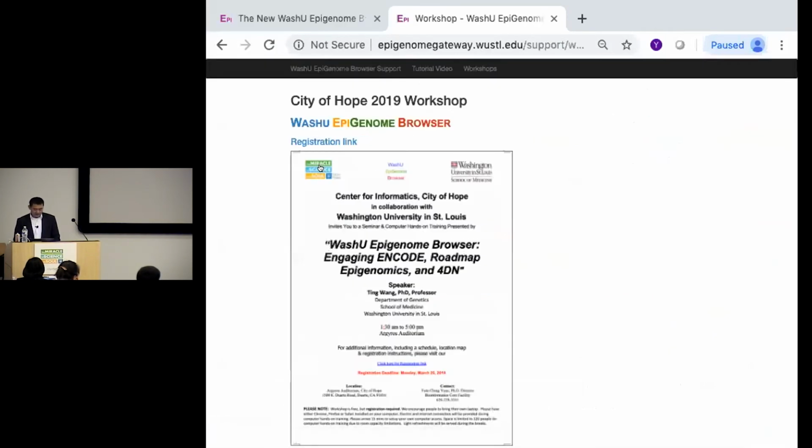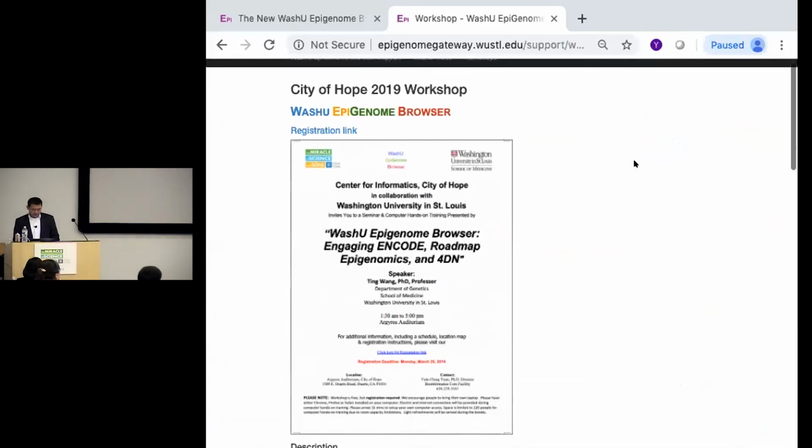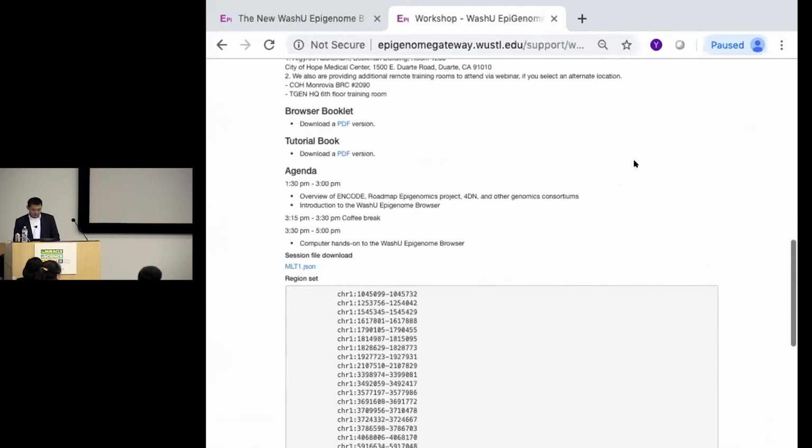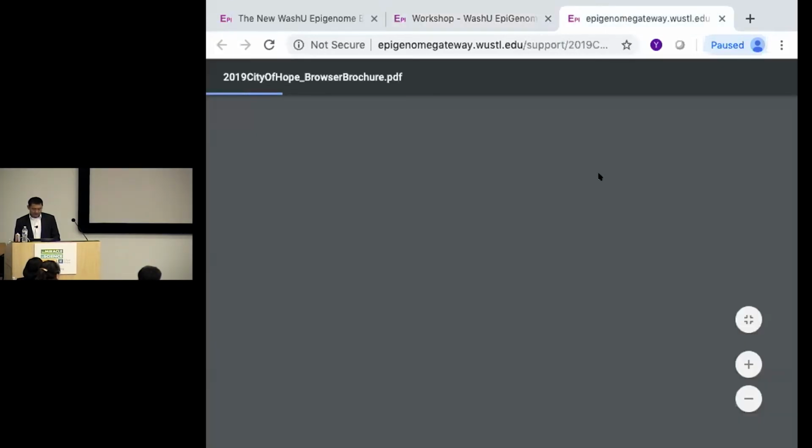If you click on this, you get to a web page describing the workshop. There are two PDFs here. The first one is actually the booklet. I didn't bring too many, I brought 30 copies, but you can get an online version here.